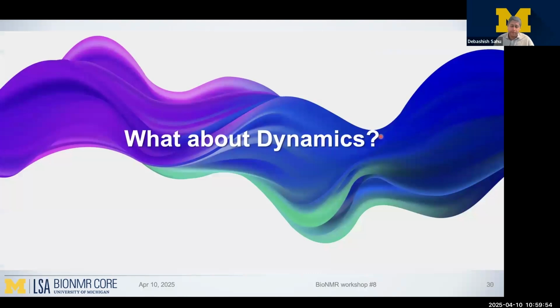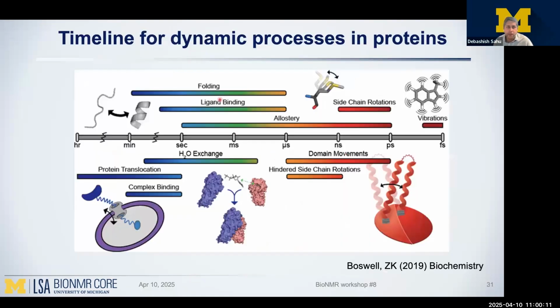What about dynamics? All we did now was the assignments, right? What will I do with these assignments? Can we use these assignments to look at dynamics of different proteins and stuff like that? And yes, we can. So we'll quickly go over different dynamics stuff over here.